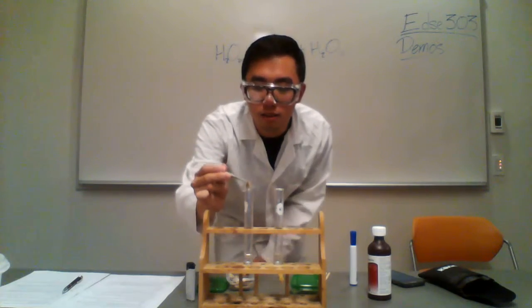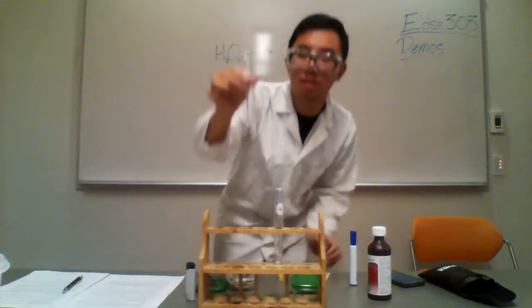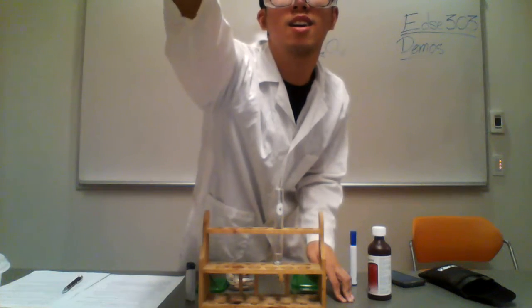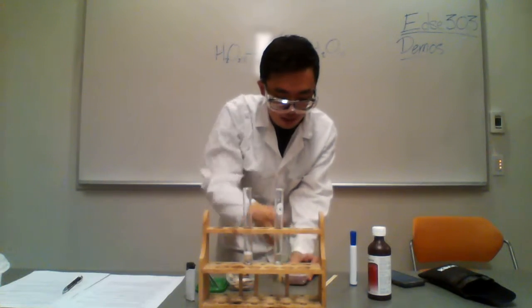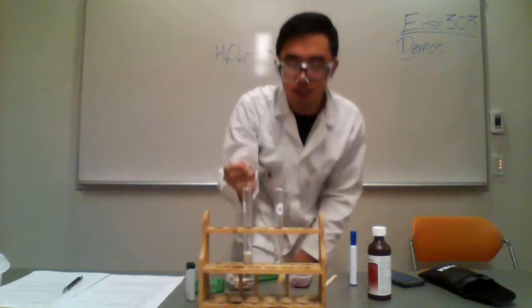So this is a potato. I'm going to drop that in there. Let everyone take a look at that. Oh, there you go, camera. You guys see what's happening there? It's bubbling. Yeah, it is. Woohoo, bubbles. Okay, cool. And now we'll do the liver that I grossly chopped up this morning.